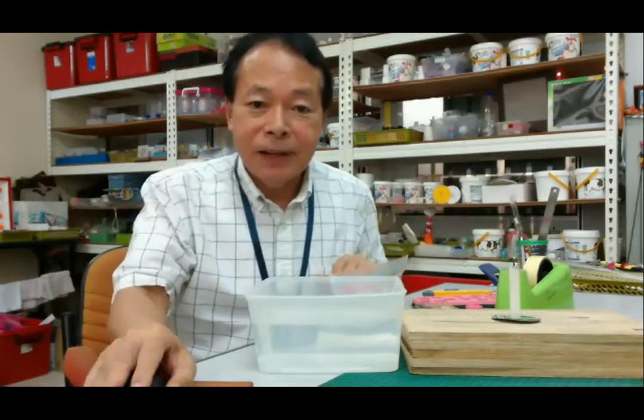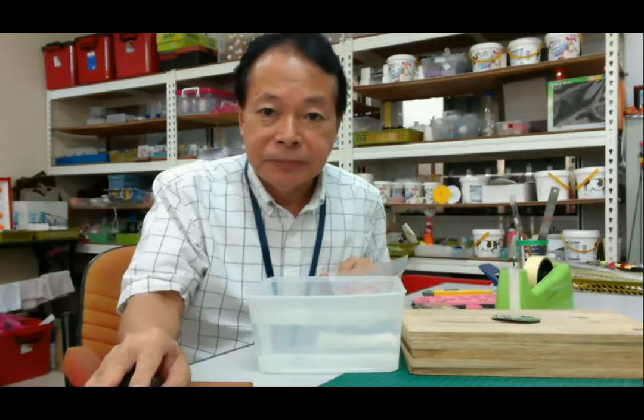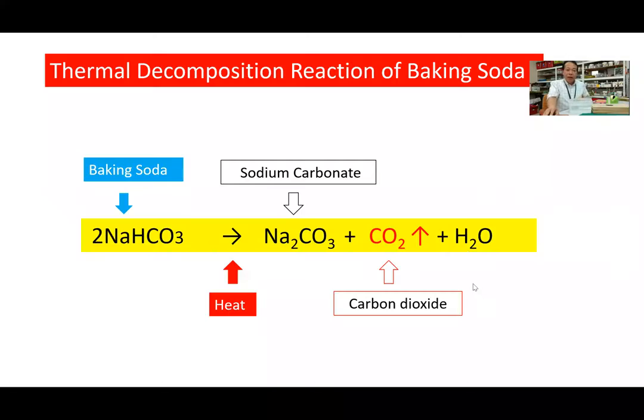Okay. First, let me show you this picture. This is a very common chemical reaction for baking soda: the thermal decomposition reaction of baking soda. This is baking soda, sodium hydrocarbonate.